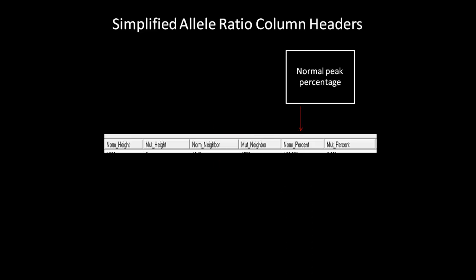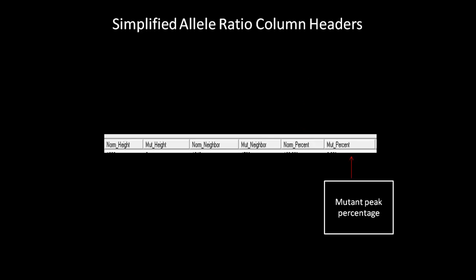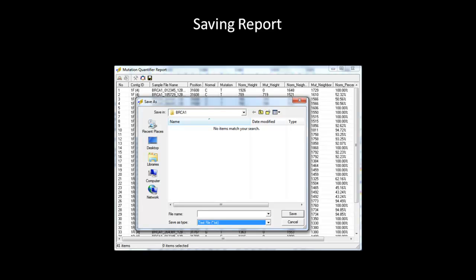The fifth column displays the percentage of the normal allele present. The last column displays the percentage of the mutant allele that was detected. For a heterozygous variation, it can range anywhere from 40 to 60%. The saving function is the same for both standardized and simplified allele ratio — click on the save icon button in the toolbar to save the report as a text file.